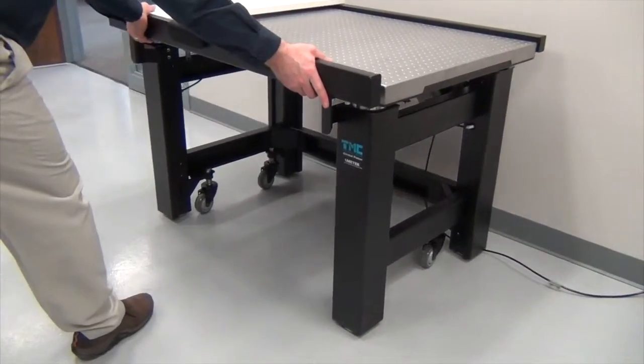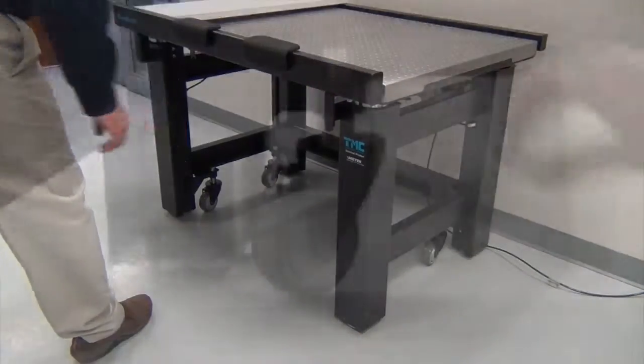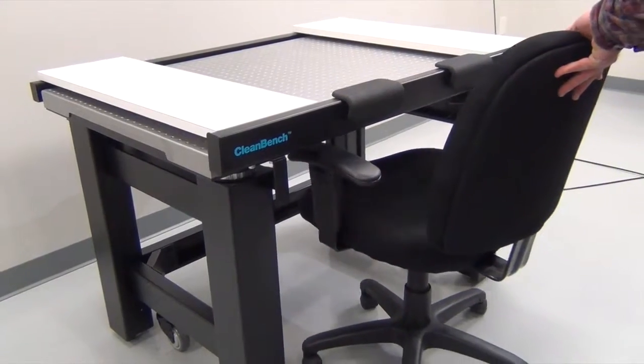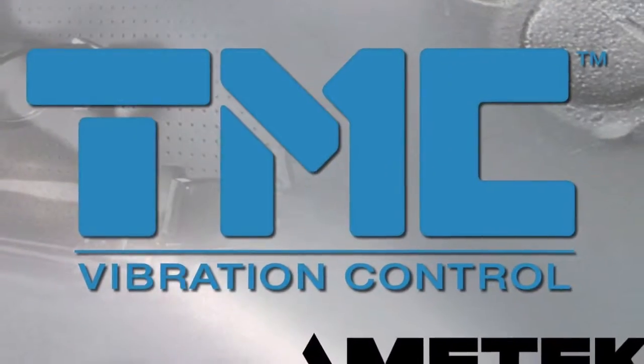To disengage the casters, loosen the adjustment bolts and unscrew until the casters are clear of the floor. This concludes this part of our clean bench setup series.